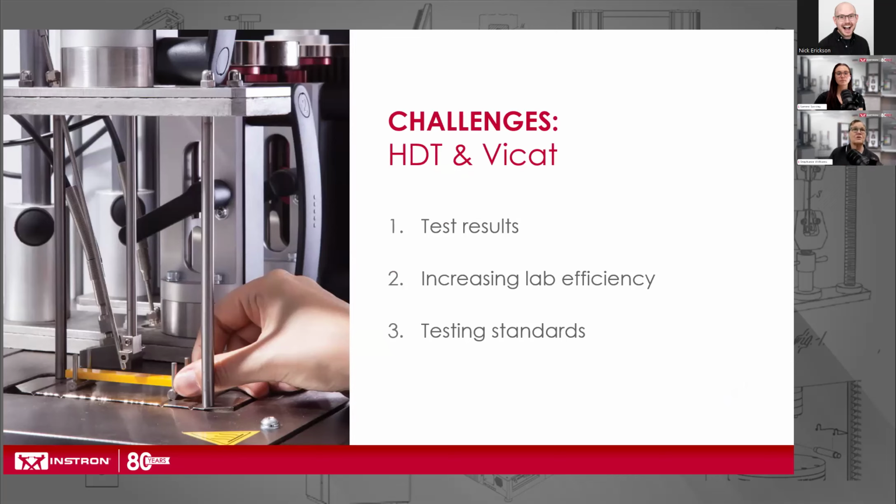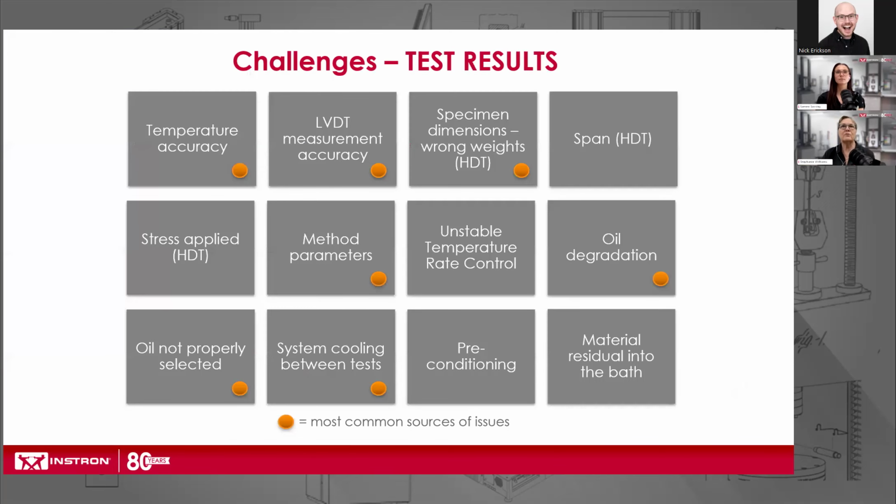HDT and VICAT challenges. Again, these are the three we're going over. Test result challenges. Biggest things here, life of the oil. Make sure you check how long you've been running your oil in your HDT. Check the spec sheet from the supplier. It will tell you what its life expectancy is.